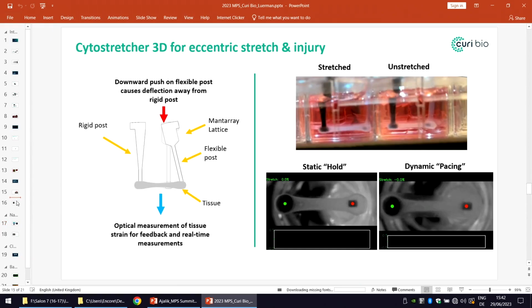Introducing infiltrating vasculature into the tendon tissue, I think, introduces variables that are hard to control in in vitro models in general. And so it's definitely a stepping stone, but I think there's a lot to study and to learn just in this model so far. All right, thanks. Next, yeah.